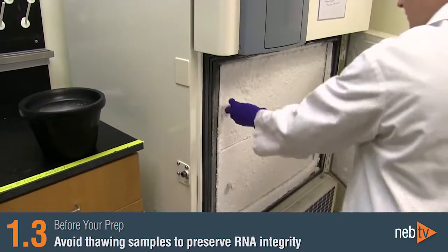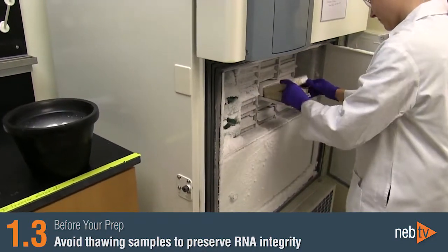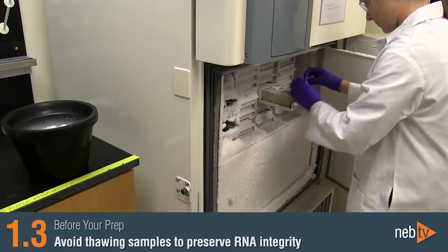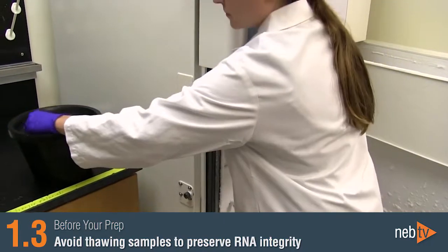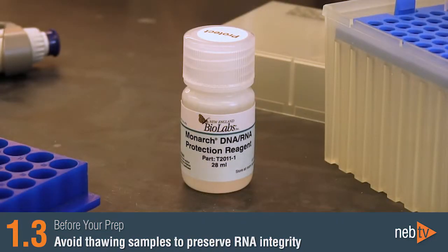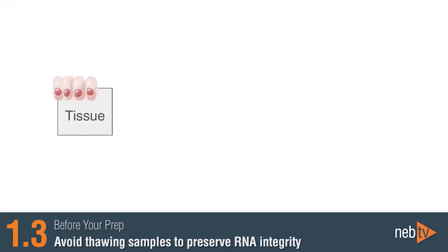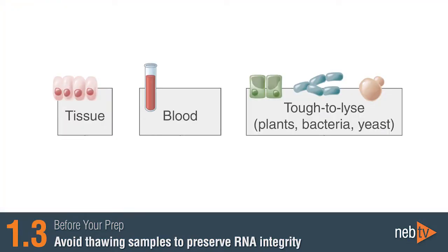It's important to avoid thawing your sample in order to preserve its integrity before extraction of the RNA. Frozen cultured cells can be thawed briefly before the addition of the RNA lysis buffer, but most other sample types should not be thawed in the absence of the protection reagent or the lysis buffer. These samples include tissues, blood, bacteria, yeast, and plants.